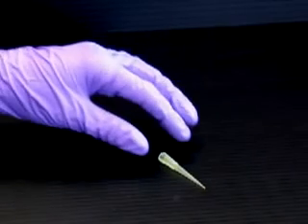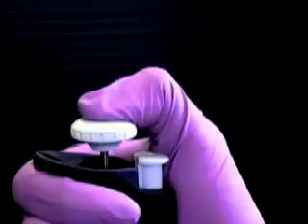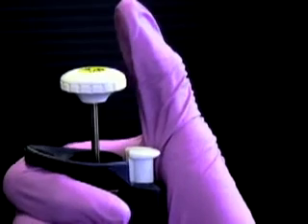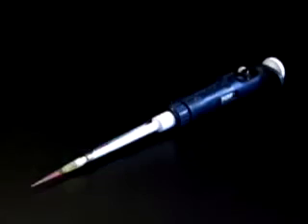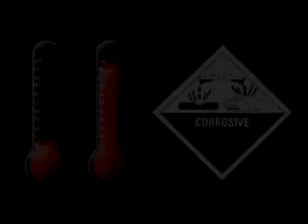In addition, take care not to drop the expensive and easily damaged pipetman. Do not allow the tip to touch anything except sample. Do not introduce liquid into the plastic shaft by letting the plunger snap up or by laying the pipetman on its side. Finally, avoid using the pipetman under extreme temperature conditions or with acids and corrosives. When used with consistency and care, an automatic pipette is an excellent means of transferring microliter quantities of liquid.